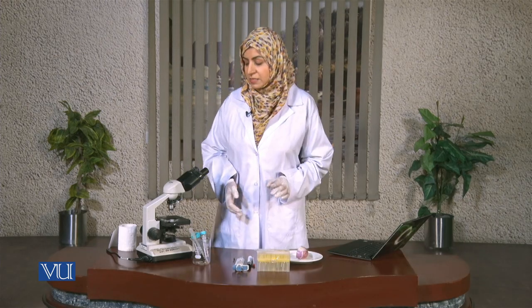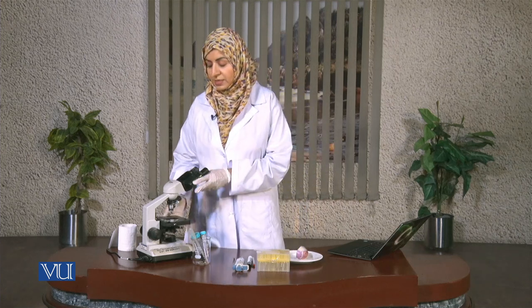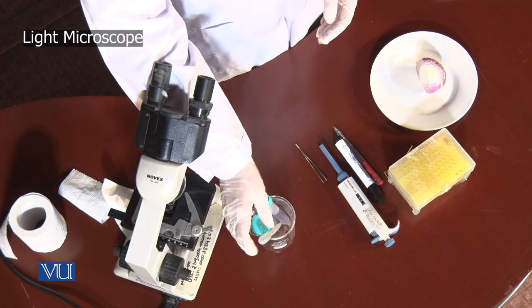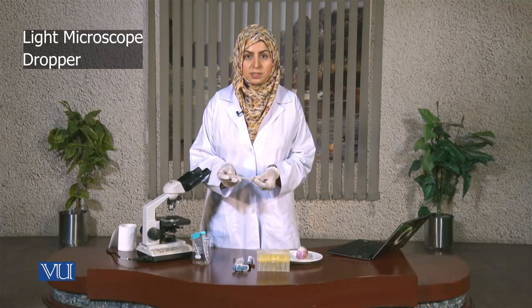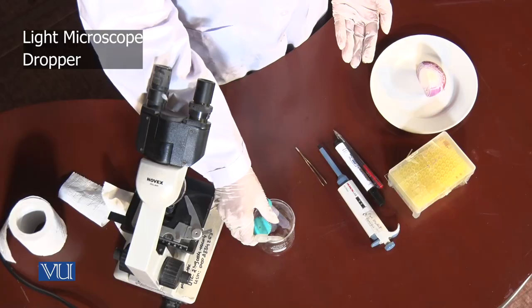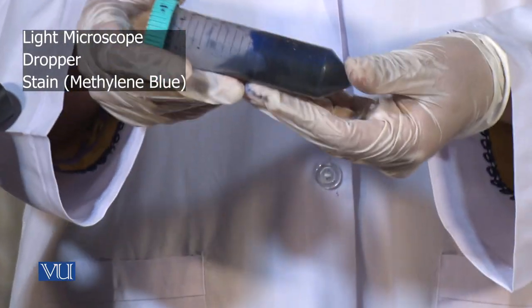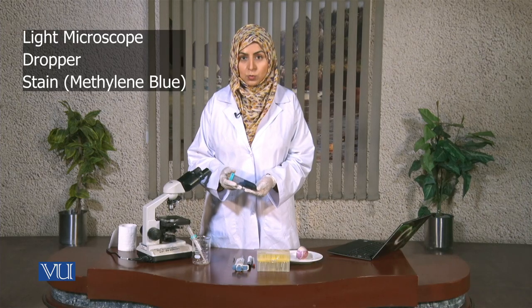So let's start with the equipment and the consumables. First of all we need a light microscope. After that we need droppers, and with the droppers we need the stain, which is methylene blue in this case.